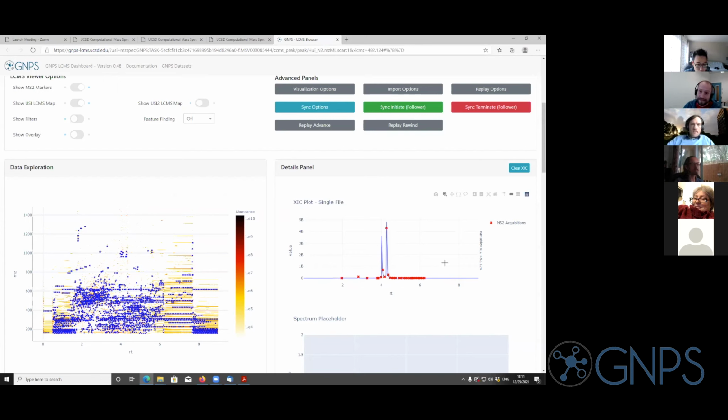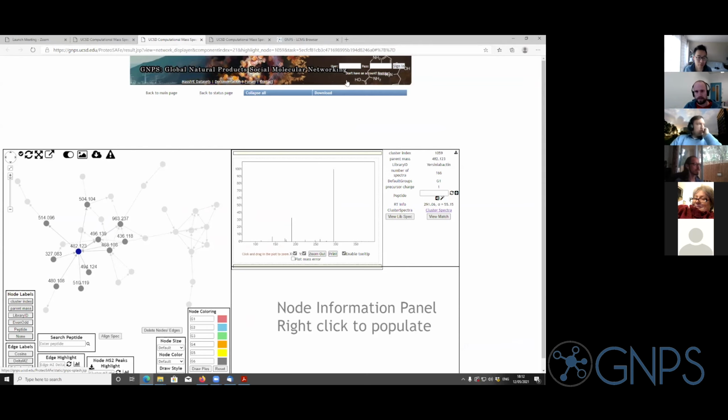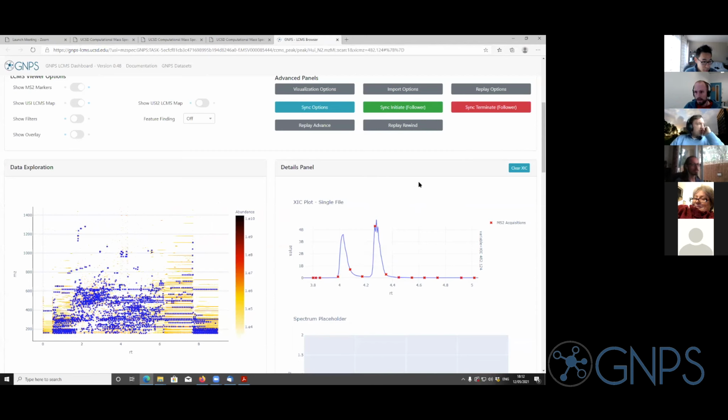So what happened is that most likely both of those peaks are isomers from the same compound, and they have very similar MS2 spectra. Hence, they're collapsed here on MS2 level, but we can perfectly resolve them by chromatography. So here, it's also a good case where actually feature-based molecular networking would be the better choice.